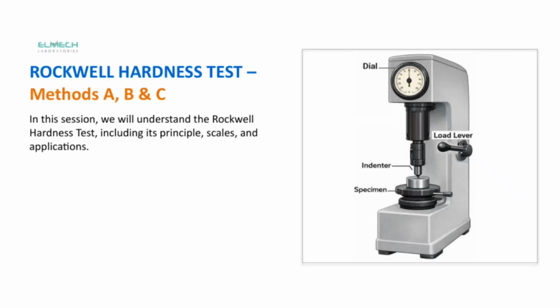In this presentation, we'll be exploring the Rockwell Hardness Test, focusing on methods A, B, and C. We'll cover how the test works, the different scales used, and its practical applications. So let's dive in and discover the essentials of this important testing method.